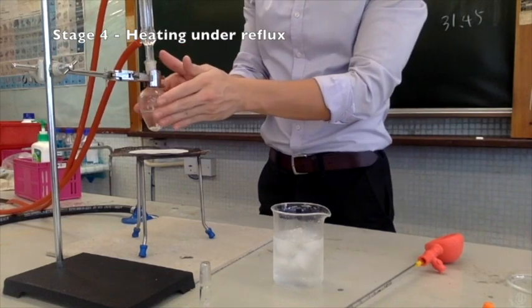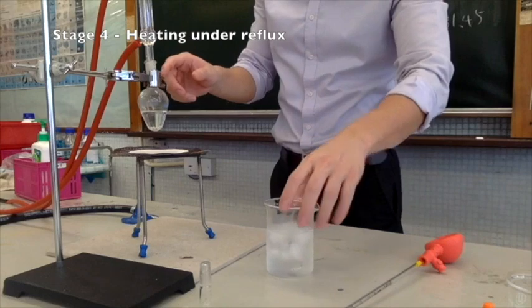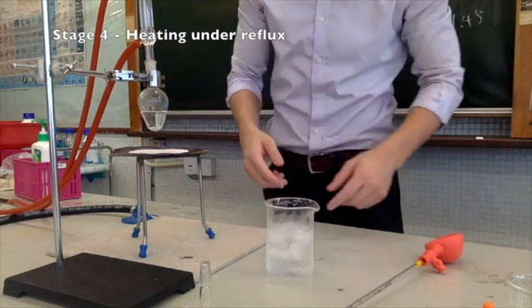Okay, once the content has been cooled off, we can prepare an ice water bath and we are going to cool it down in the ice water bath.